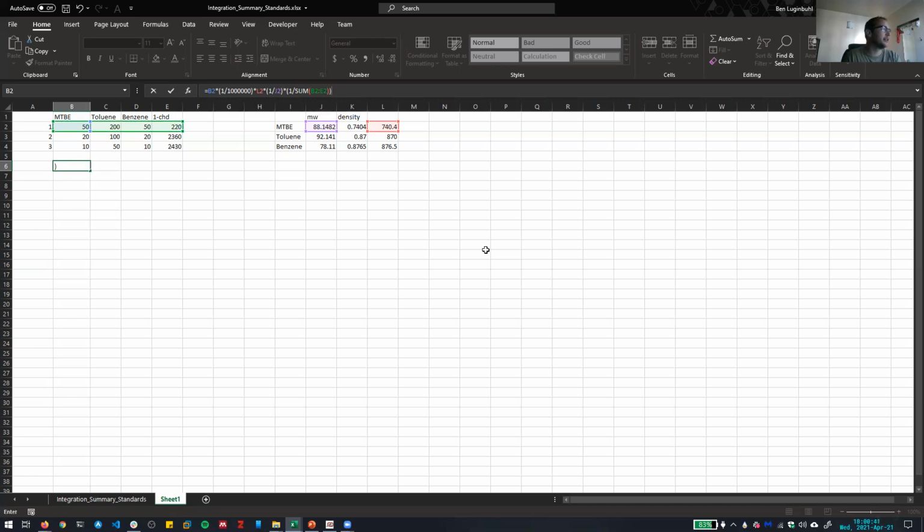We'll do that and then close that parenthesis. So that should be dividing by our total volume, but that volume is now in microliters, right? So we need to multiply that again by another correction factor, I think. So times 1e6. And so that actually ends up canceling the one we did here.